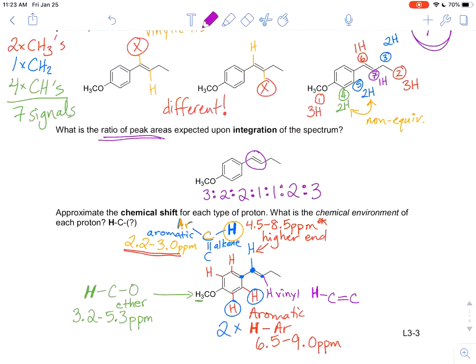It's too far away from the arene group to have a huge effect. As you learn more about proton NMR, I'll teach you later on how the effects actually do make a bigger difference. But for right now, we're just trying to do simple categorization based on the table that I've given you. So 4.5 to 8.5 is going to be the general range for that proton.